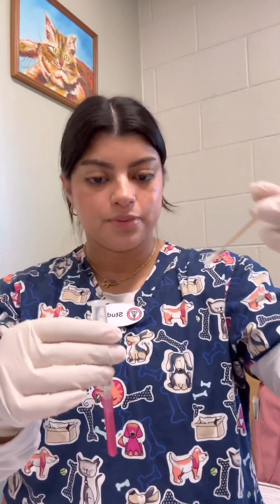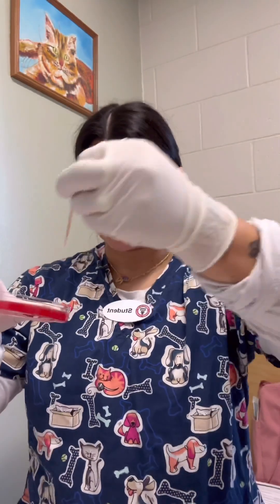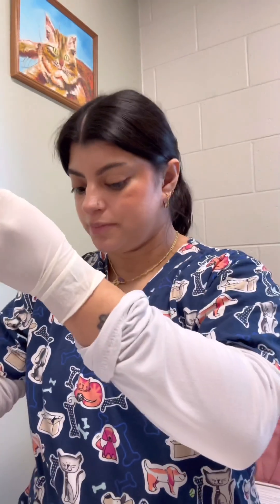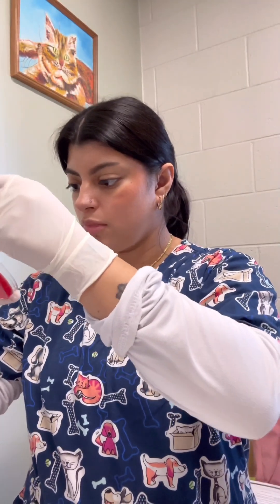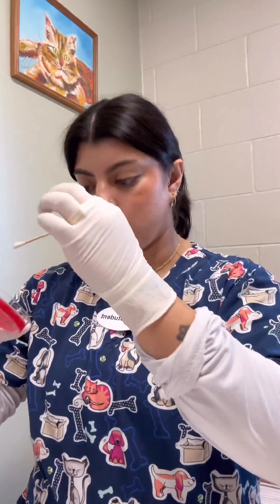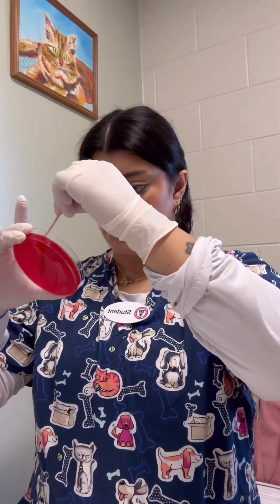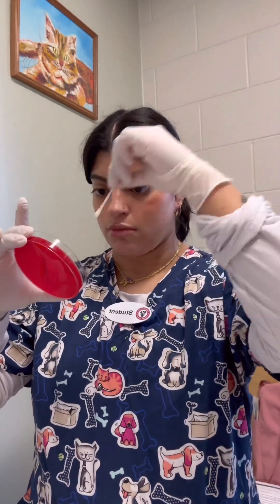Taking the swab out, then I use my Agar plate, opening it up. Now I'm going to swipe the swab horizontally across the entire Agar plate. Now that I have done that, I'm going to do it again at 60 degrees. So my Agar plate now has the sample on it.